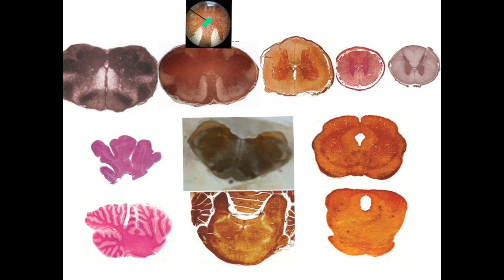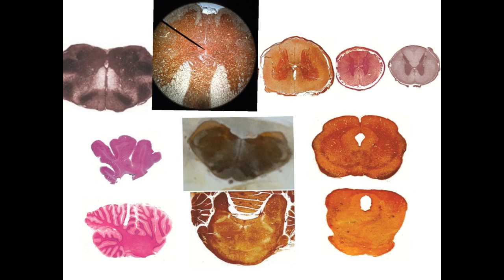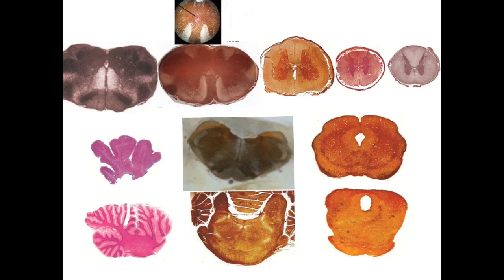Here I am making another picture to show you that this section has a central canal, but it is actually compressed or elongated, so it may not be evident. But actually the shape of the butterfly or the two birds is very evident. This is the head, the wings, and the tail, and the limb, and the head, the wing, the tail, and the limb. So they are very characteristic of the closed medulla motor.